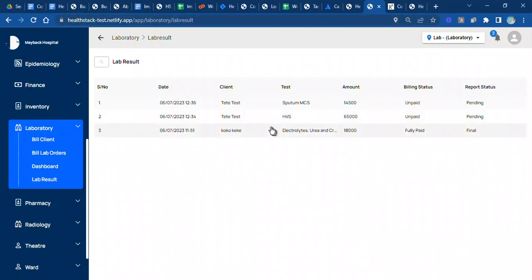In this video, I'll be showing you how to report a lab result using our new lab result templates. So before I go there, let me introduce us to this list, the lab result list.